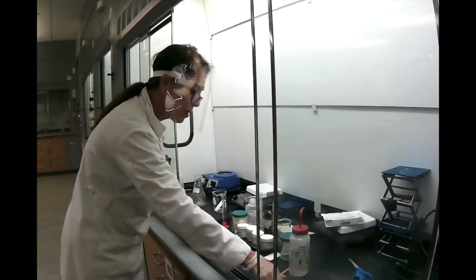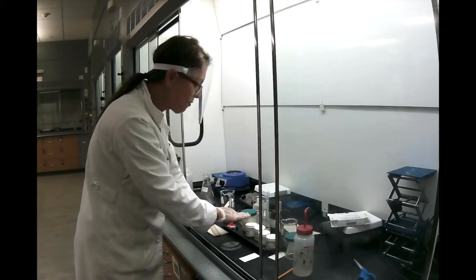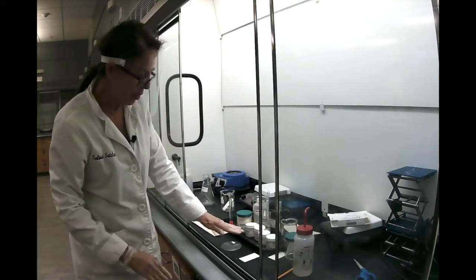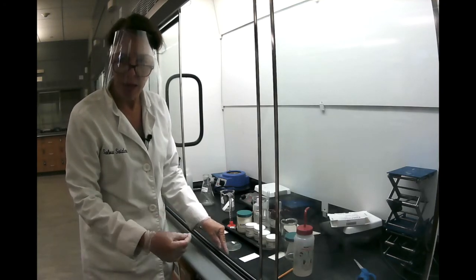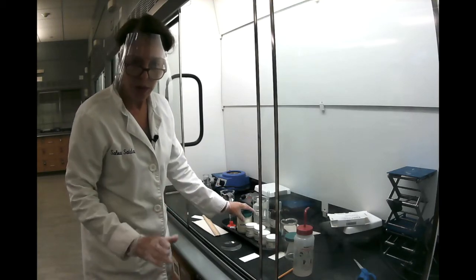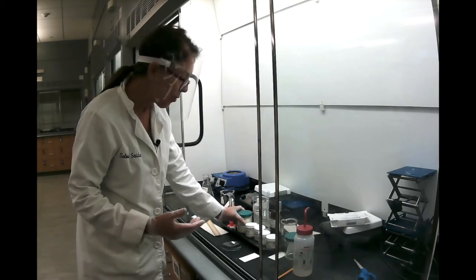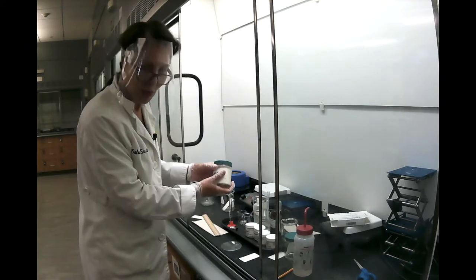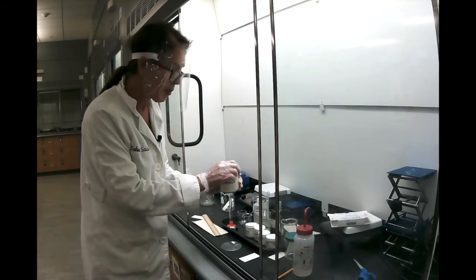Now, how do you do this? I have here my five knowns in order. I don't have room on the TLC plate to write their name, so I just put 1, 2, 3, 4, 5. But make sure you take note of what is 1, 2, 3, 4, and 5. Make sure you know in your lab notebook what each substance is. So my number 1 is aspirin.